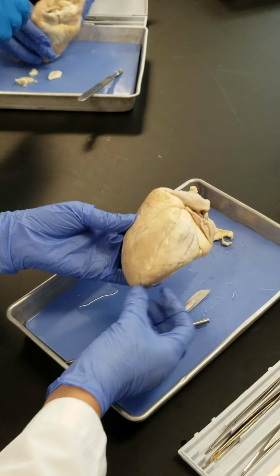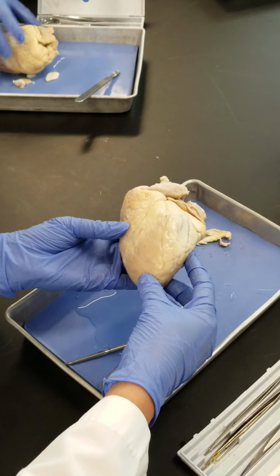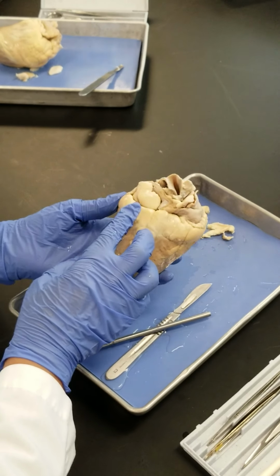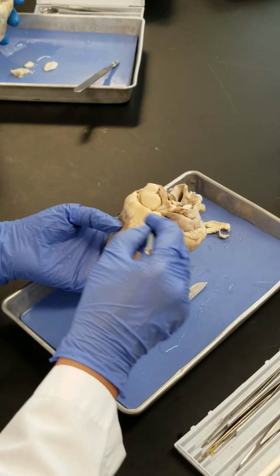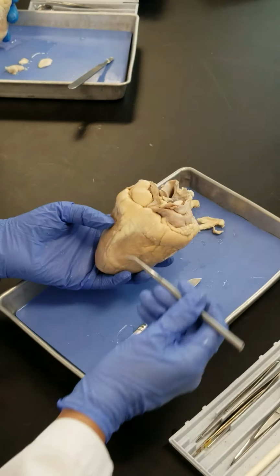Right? And also you see the apex, which as you see is a little bit different, like this should be in humans like this, right? So going toward the posterior side. On the posterior side, as you see, the coronary sulcus is a little bit lower. You see the atria here and the vessels that are getting into the atria.